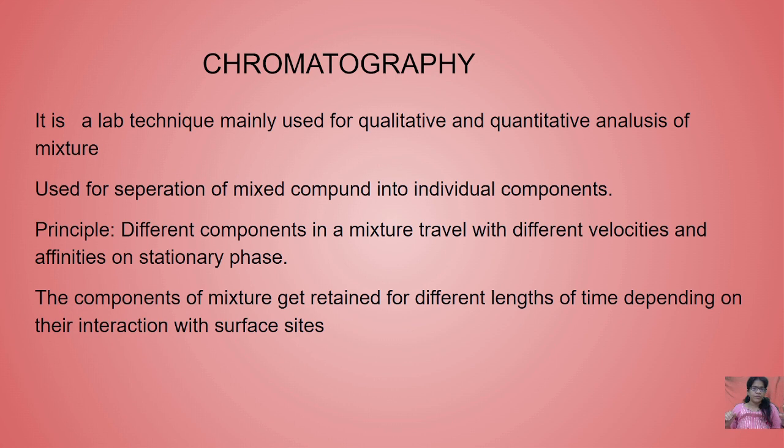It is used for the separation of mixed compounds into individual components. When you take a sample, after the separation you look at the affinity, how the particles stay on the stationary phase and how they travel with the mobile phase. The main principle is that different components in a mixture travel with different velocities and affinities on the stationary phase, so the components get retained for different lengths of time.